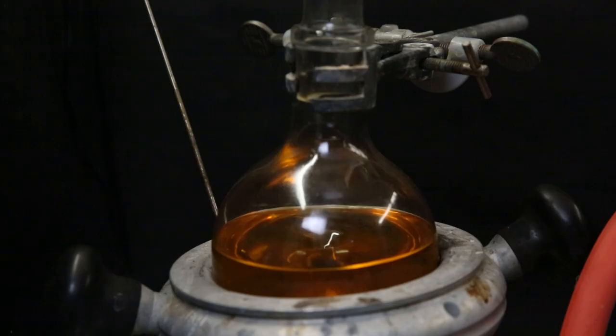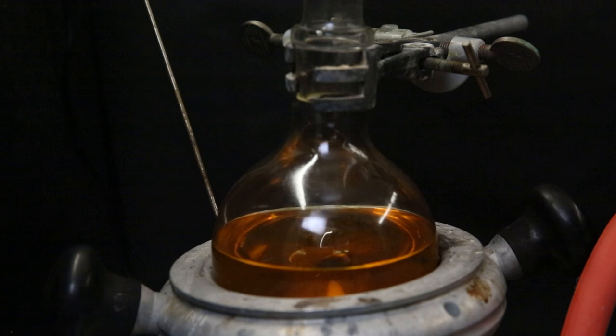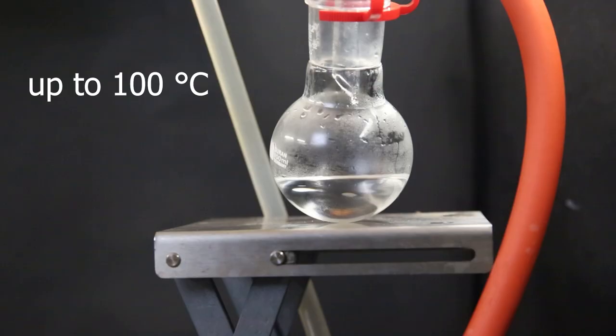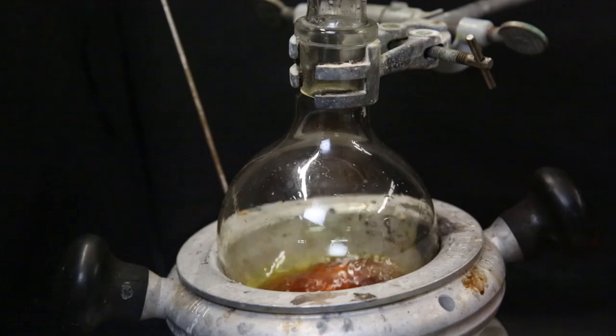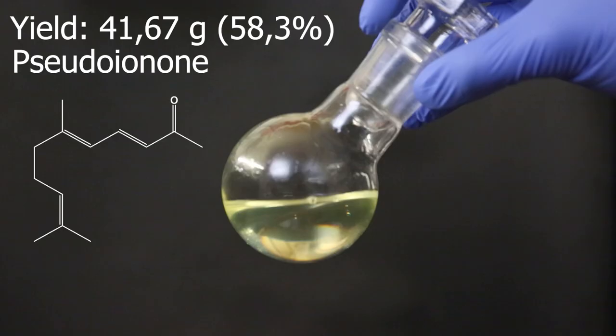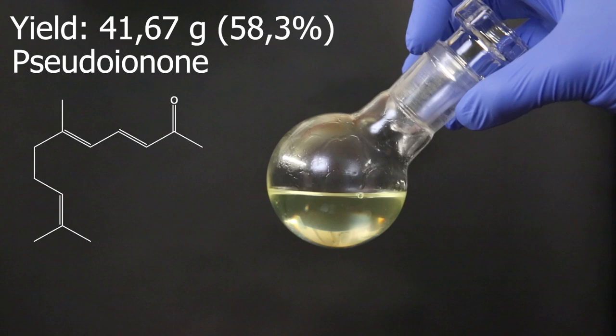Then I swapped the setup for a vacuum fractional distillation setup and collected the first fraction, which is likely some remaining solvent, unreacted citral and side products. After that, the pseudo-ionone started coming over between 100 and 110C. After this, no more came over and in the distilling flask some orange oil remains. In the end, I am left with 41.67 grams of pseudo-ionone, which is a yield of 58.3% if we assume 100% purity.